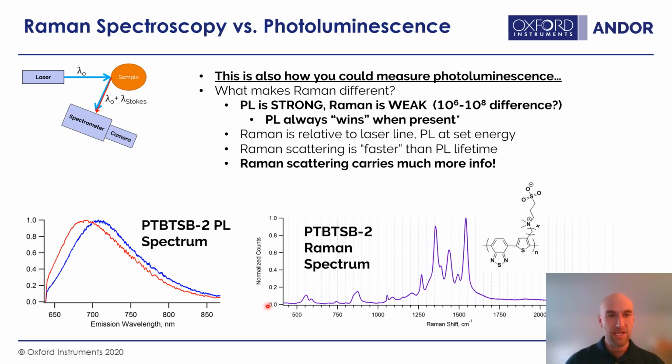But you can see, instead of one large, broadly spread out progression, you have lots and lots of small peaks, probably about 20 or 30 overlapping narrow peaks. We'll talk about what these mean. But if you were to record just simply in a notebook or a spreadsheet, how much information would it take you to record the spectrum? Well, you'd have to go through each peak and say, okay, here's the center energy, here's the center wavelength, here's the width, here's the intensity. And you'd have quite a roster of peaks at the end of this process.